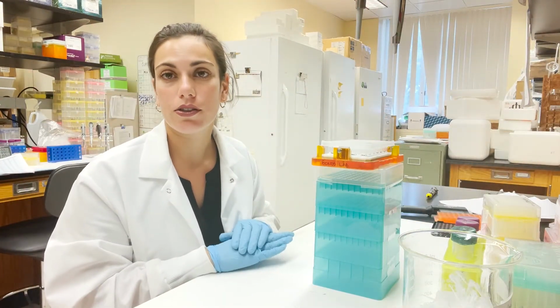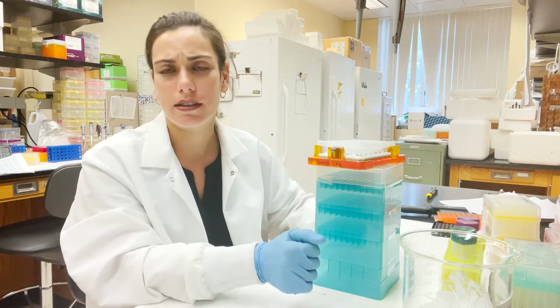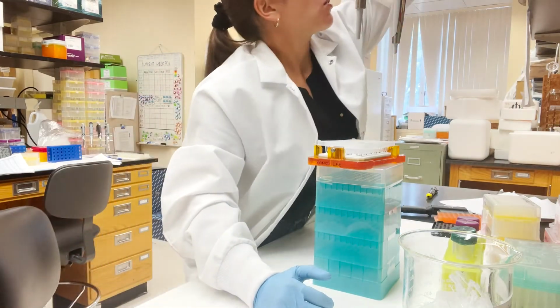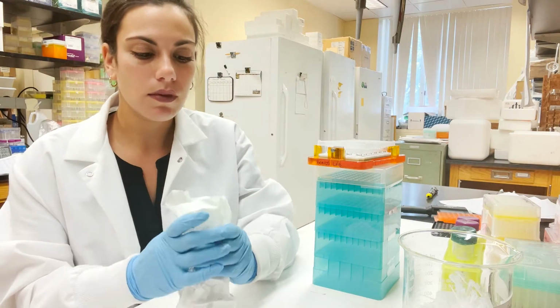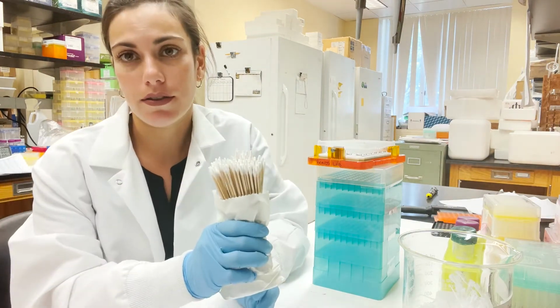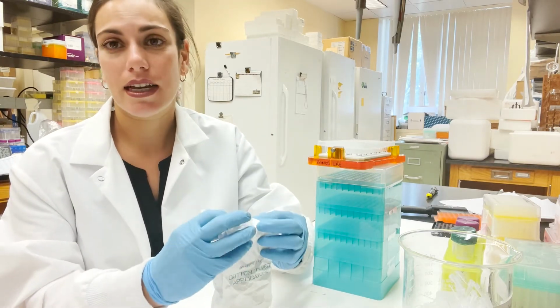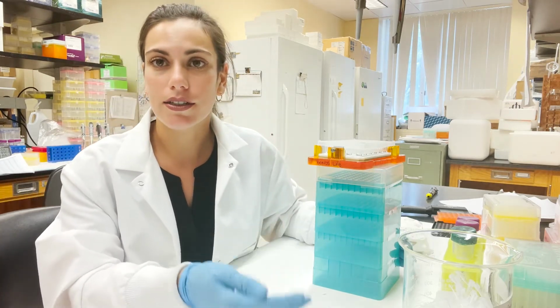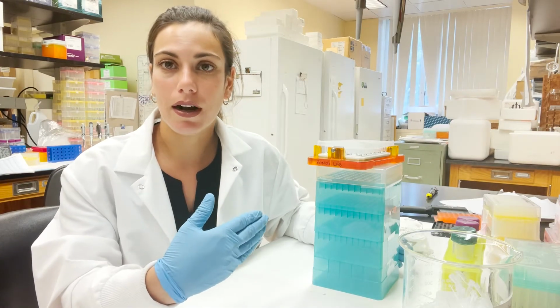Now I let the ethanol dry out completely. Sometimes this is a little bit difficult to do, so if we really need to, we can go in with these sterile cotton swabs and we can wipe out extra parts of the ethanol. We do this for approximately 5 to 10 minutes. Sometimes it takes 10 to 12 minutes. It really depends on the conditions in your lab.